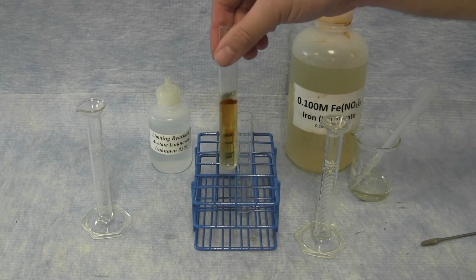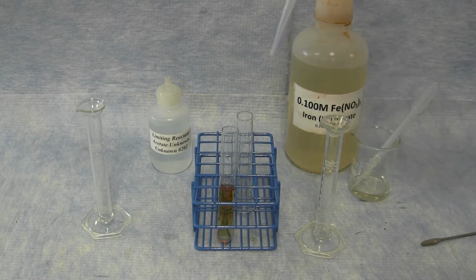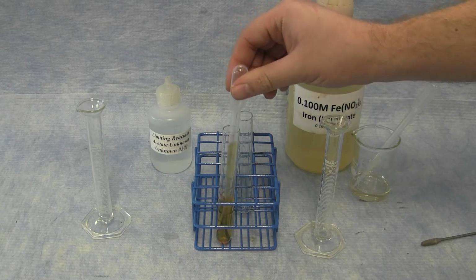You can see the color change that happens when the two are combined. You could use a pipette to mix the two together thoroughly.